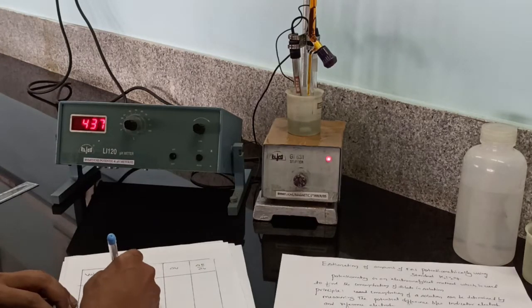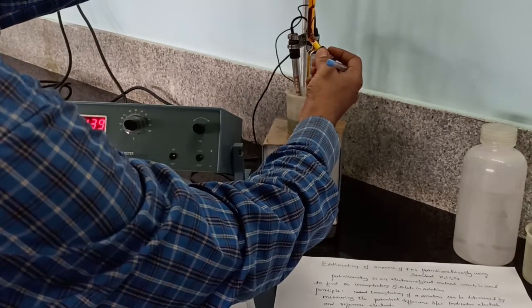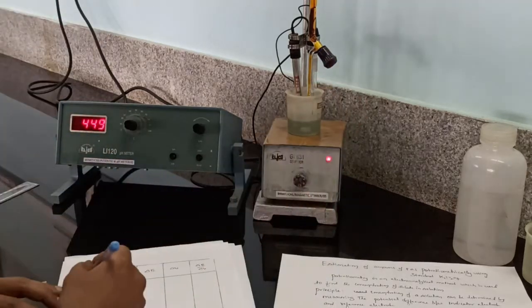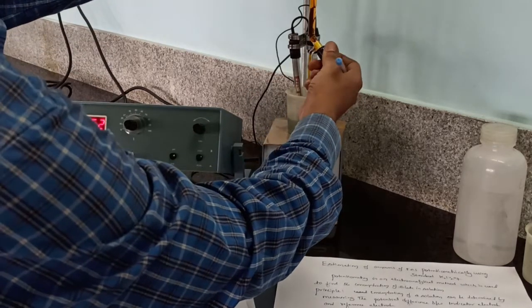At 0.5, the EMF is 438 millivolts. At 1, the EMF is 452 millivolts.